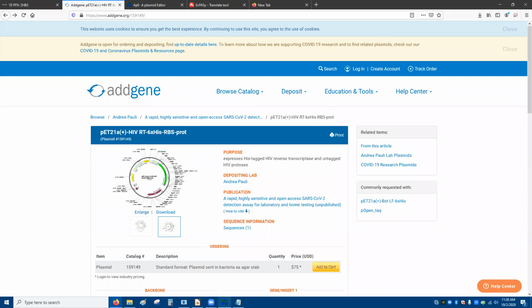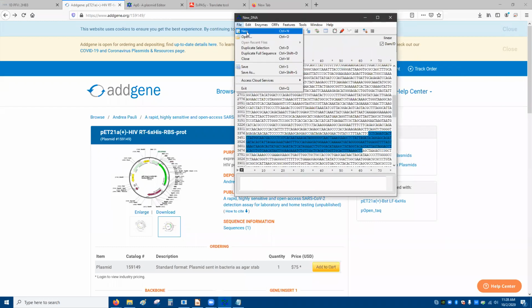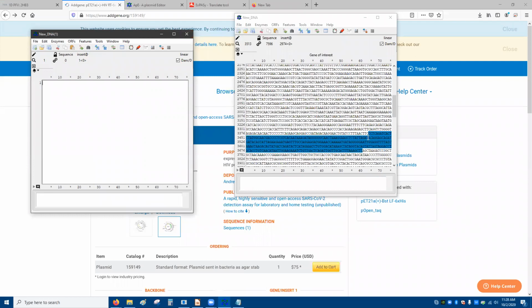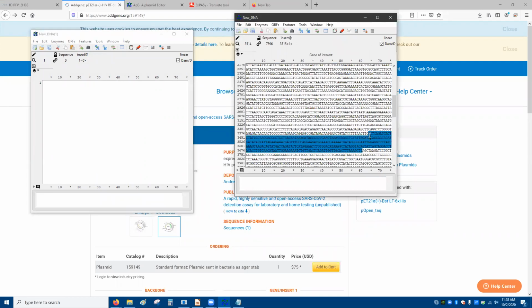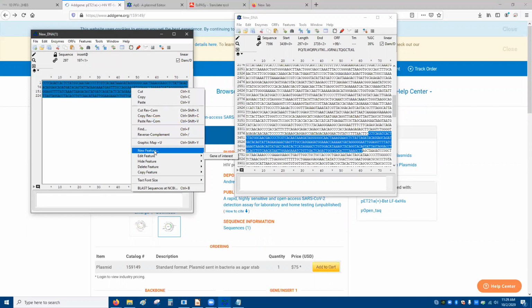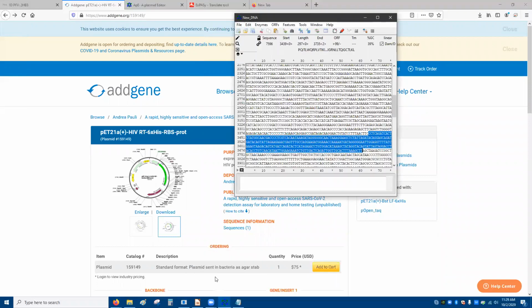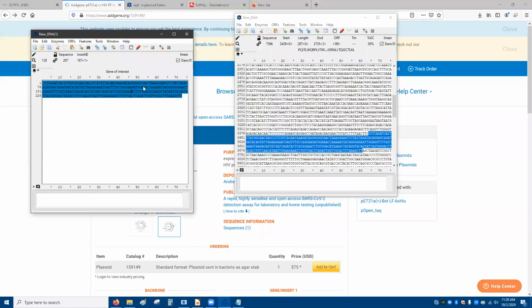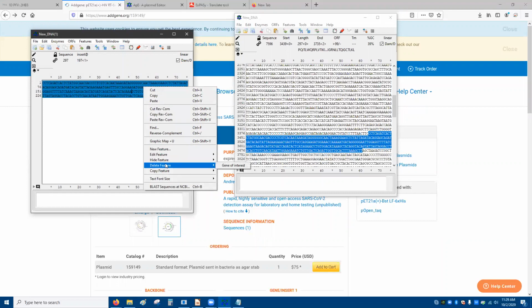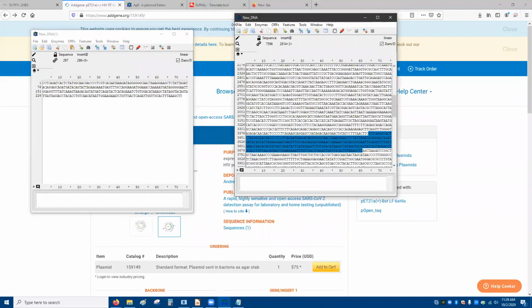So next thing you're gonna wanna do is open, oops, sorry. I wanna make a new thing. So this is gonna make it a lot easier to see what we're doing, less busy. And then I'm going to delete the feature. I'm gonna click out. Okay, so now we're gonna delete the feature. You could leave it there. I find it's better to start fresh.